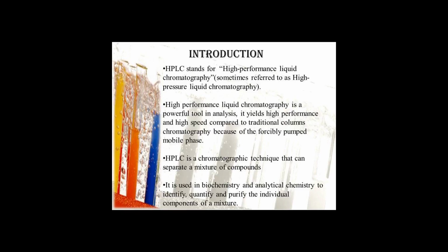D, useful for diagnosing vitamin D deficiencies in children. It was found that sensitivity and specificity of this CPBA reached only 40% and 60%, respectively, of the capacity of HPLC. While an expensive tool, the accuracy of HPLC is nearly unparalleled.